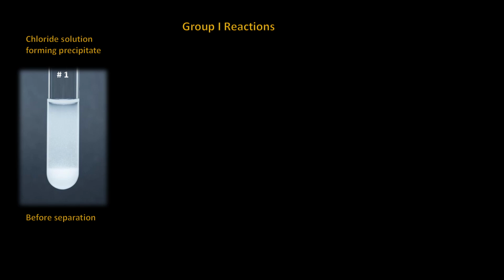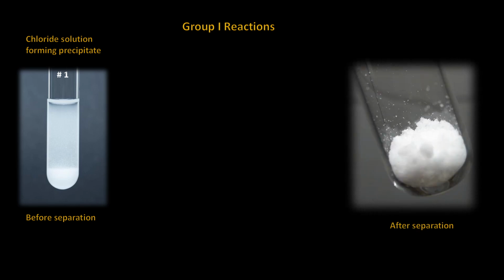Its decomposition is hydrogen ions and chlorine ions all floating around in water. How an acid dissolves materials is beyond the scope of this series, but it is enough to state that acids, solvents, and others will dissolve materials. The chlorine in the water makes the solution a chloride solution. The solubility table shows the elements in the group 1 category are all insoluble in a chloride solution and will not dissolve. They would remain as a residue or, in some cases, a precipitate.